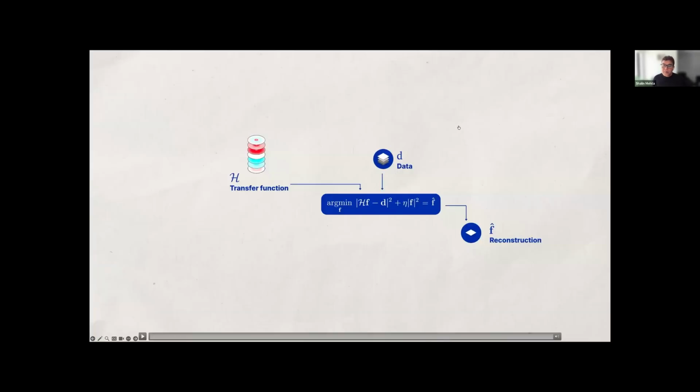So how does this work? In this specific scheme, we are doing 2D phase from defocus. I'm going to frame this as a computational graph. And the first node, the central node in the graph, is the deconvolution node, where we are modeling the relationship between the object, which is the quantity we want to reconstruct, the quantity f here, and the data through the transfer functions. So let's say we have a few 7-slice Z slices.